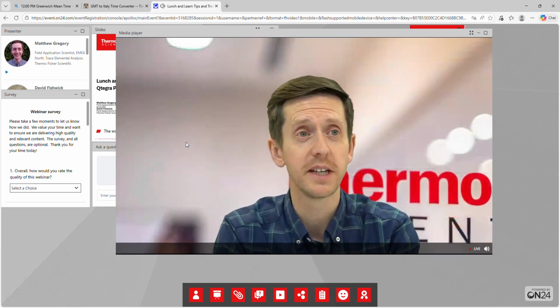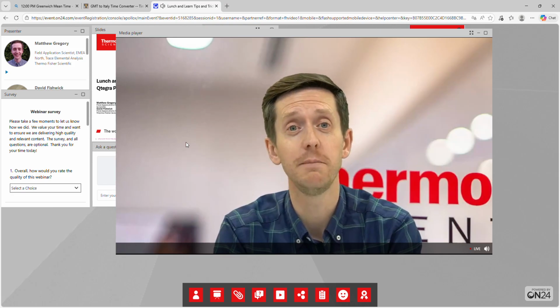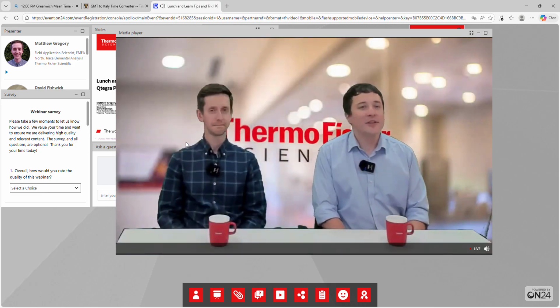So as we can see, the get ready process provides a structured set of steps that reduces the risks of any missed tasks and supports consistent day-to-day performance. So thanks, Matt, for showing us those nice features of Get Ready.